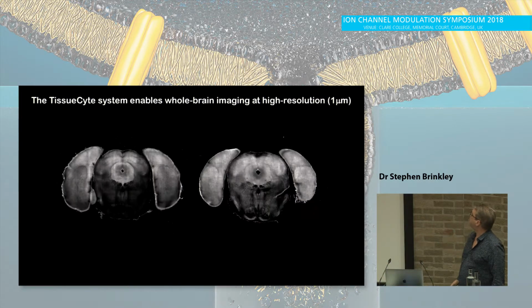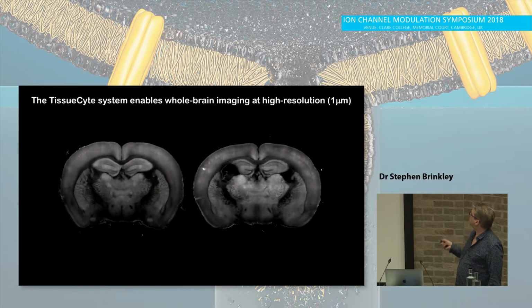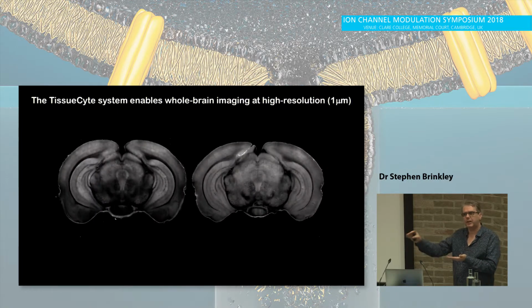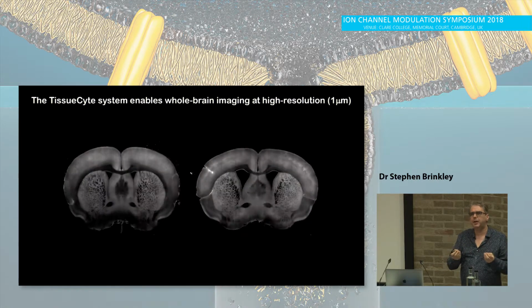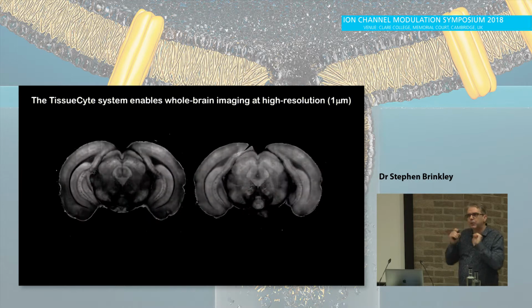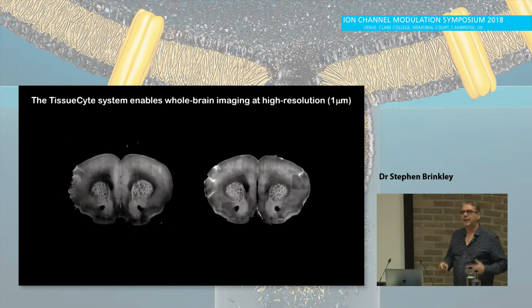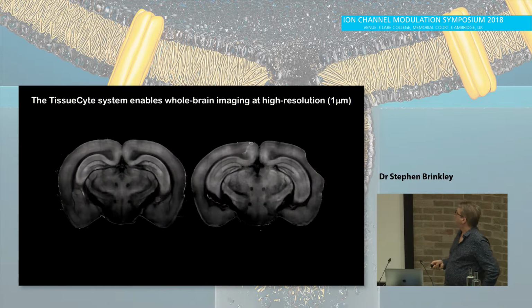This is some data from 2 mouse brains showing you full reconstruction of each coronal section. So what happens, of course, the TissueCyte, it's an automatic vibratome slicer, slices the coronal section, images little bits of it at very high resolution. We can use high numerical aperture lenses, stitched together. You can see them sometimes flashing up the little squares. That's raw data. That's a 2 to 3 terabyte data file, each of those mouse brains. They're hard to handle, but they're quite dense. They're quite rich in information.